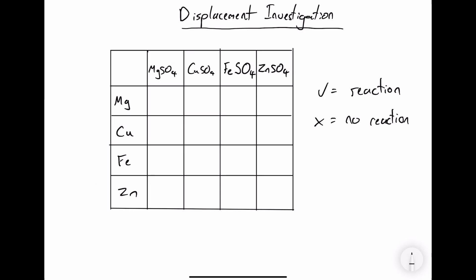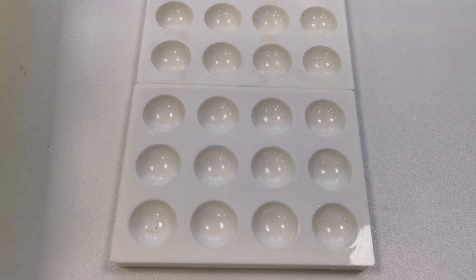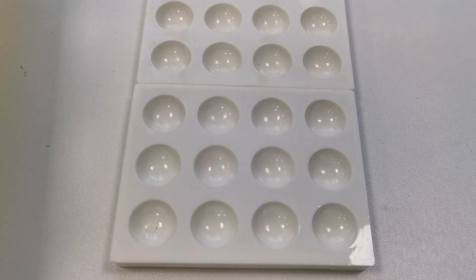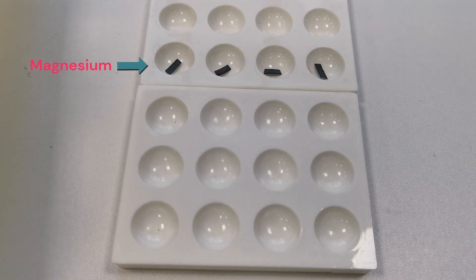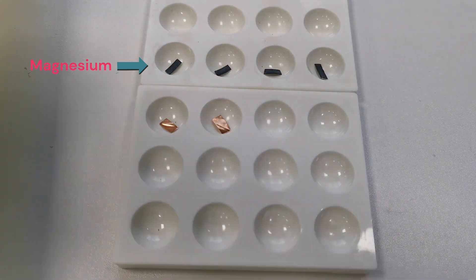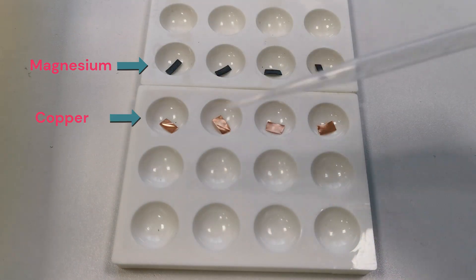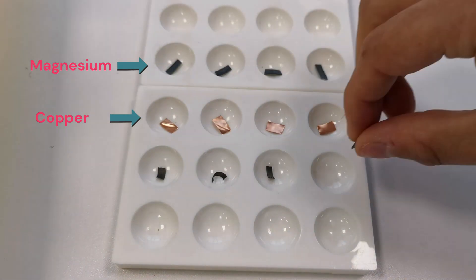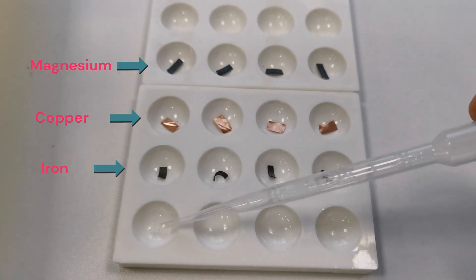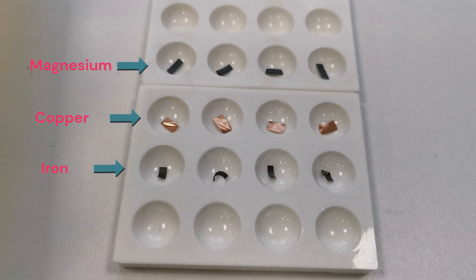Next we're going to investigate displacement reactions — put a tick or a cross in each box to show if there's a chemical reaction taking place or not. Into the first row I'm going to add magnesium metal, into the second row some copper metal, into the third row some iron metal, and into the fourth row some zinc metal.